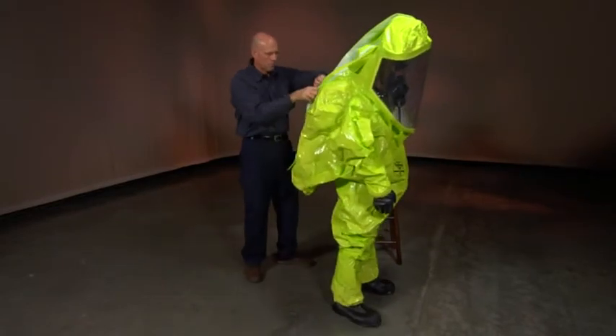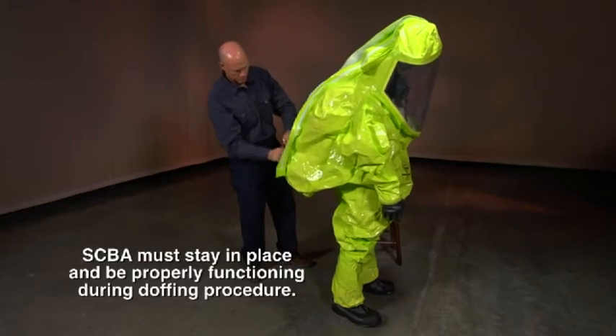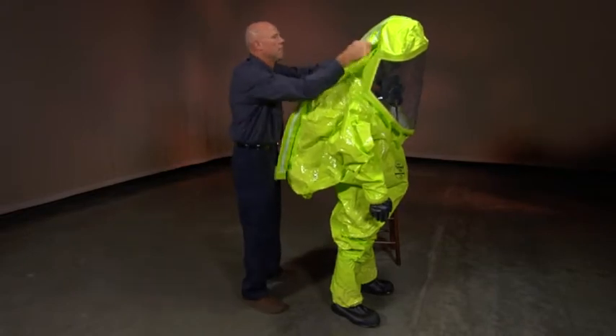Open the zipper flaps by opening hook and loop closures, or by removing tape over the zipper. Carefully pull open the zipper from bottom to top.